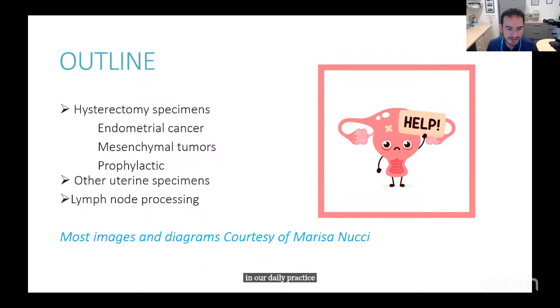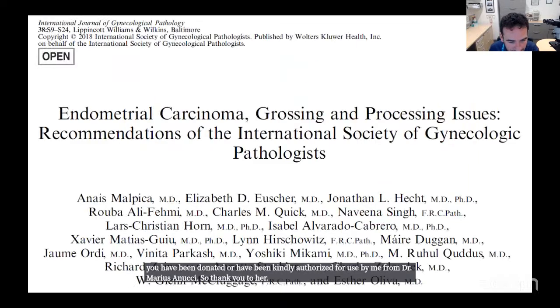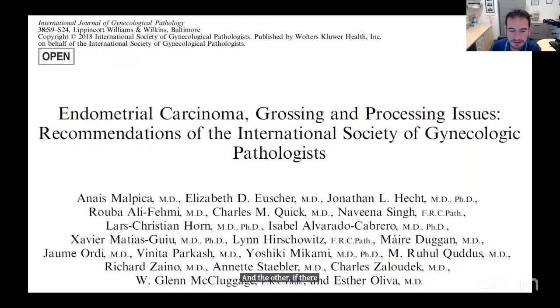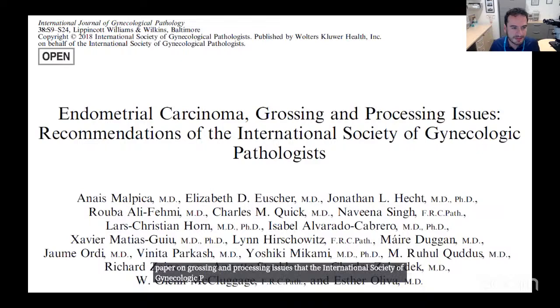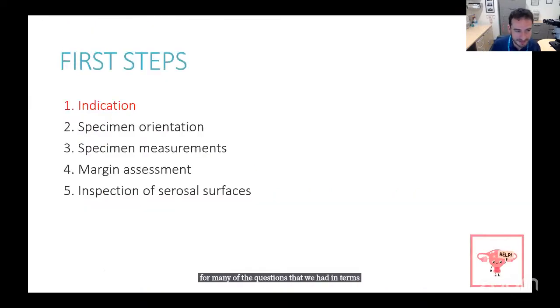A lot of the images and diagrams that I'm going to show you have been kindly authorized for use by Dr. Marisa Nucci, so thank you to her. And if there's one resource I want you to go find after this, it is the very comprehensive and helpful practical paper on grossing and processing issues that the International Society of Gynecologic Pathologists published in 2019. This is already 5 years old, but it really set a consensus standard for many of the questions that we had in terms of how to approach these specimens.